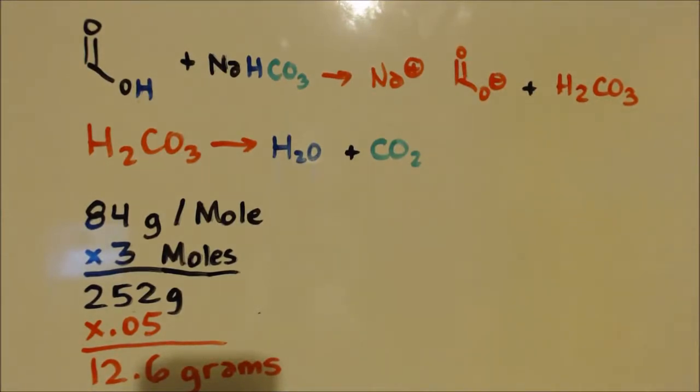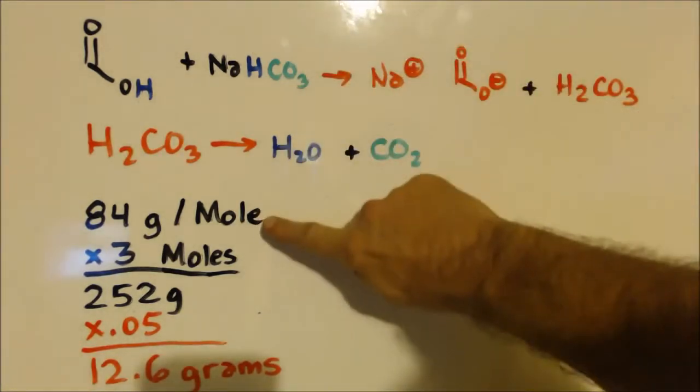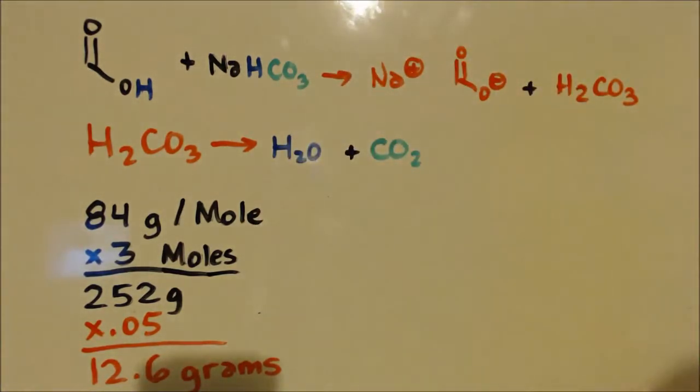Now, in the last video, I made 5% of a 3 mole solution of the formic acid, okay? So I'm doing the same thing here. I'm taking the molar weight of this, or mass of that, which is 84 grams, and I'm going to take that times 3, which would be 252 grams, but I only did 5%.